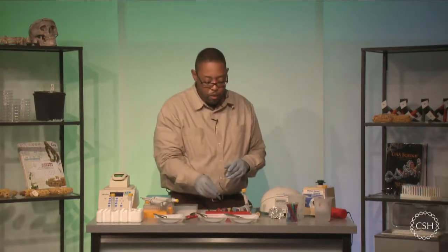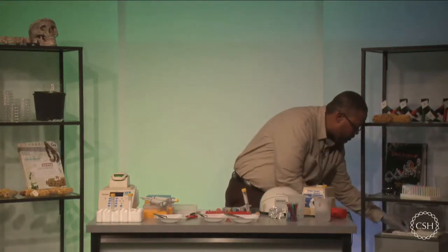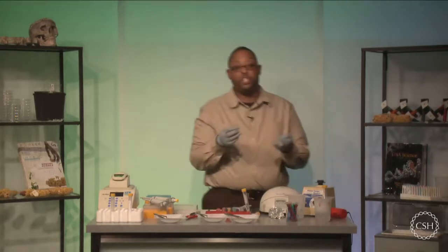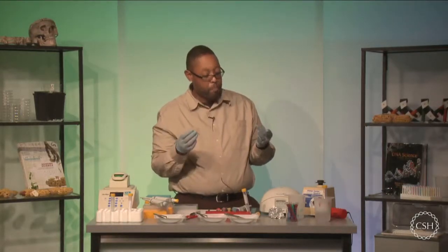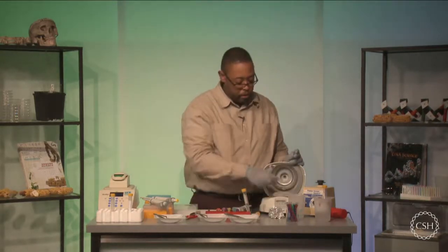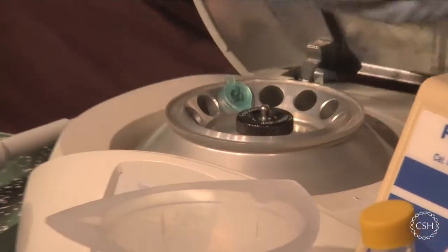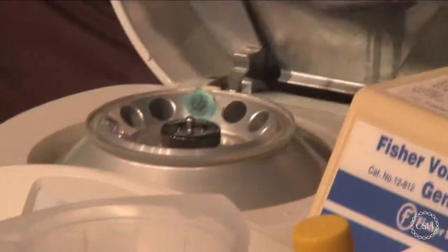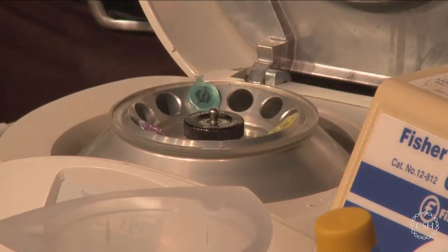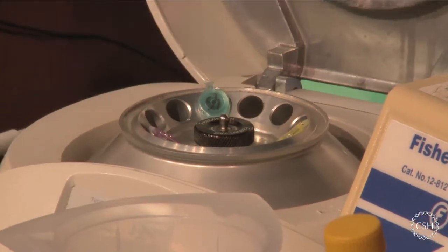Okay? So after we incubate for about 10 minutes, we will take our samples out. And at this point, all of the tissue should be essentially broken up and has released a lot of the DNA into the solution. So what we're going to do is open up our microfuge, and we're going to place our test tubes in a balanced configuration. Now, I'm going to make sure I'm placing my test tubes in an orientation where the hinges are pointing outward. So I'm going to make sure that this hinge is pointing outward towards me.